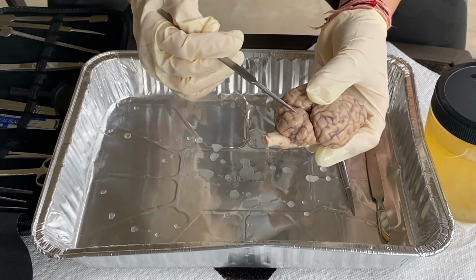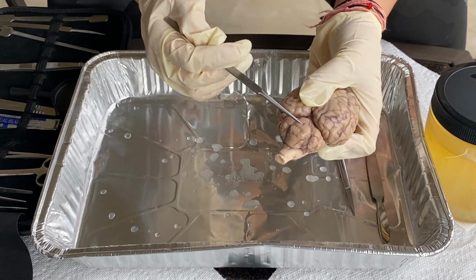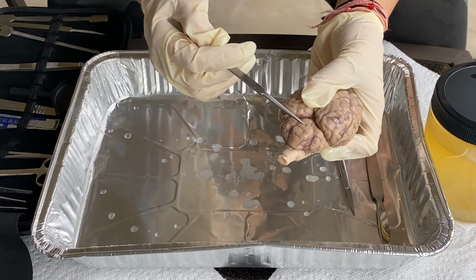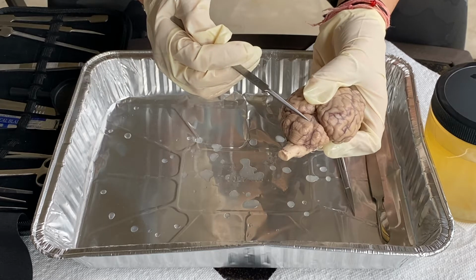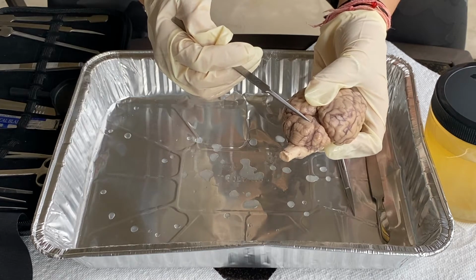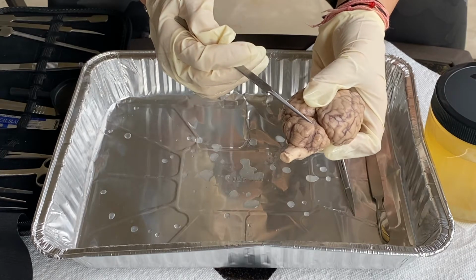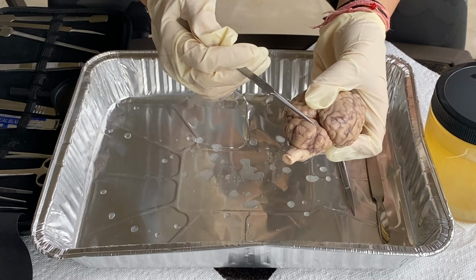This is the cerebellum, and the cerebellum is responsible for maintaining balance and movement. It sends signals for the body to adjust and move appropriately. It also coordinates movement with different muscle groups and times the muscle actions appropriately so that the body can move smoothly. The cerebellum also helps coordinate a lot of eye movements.